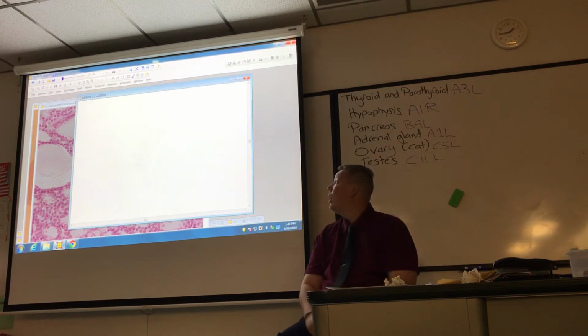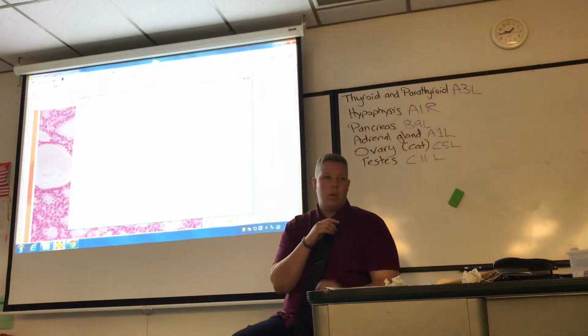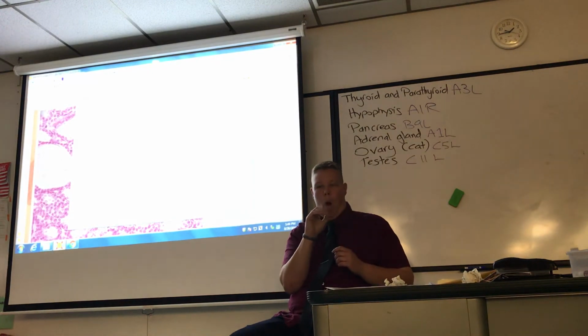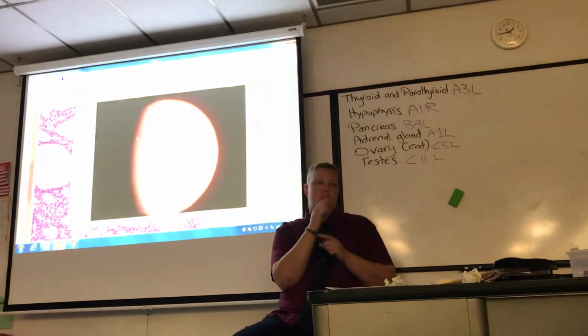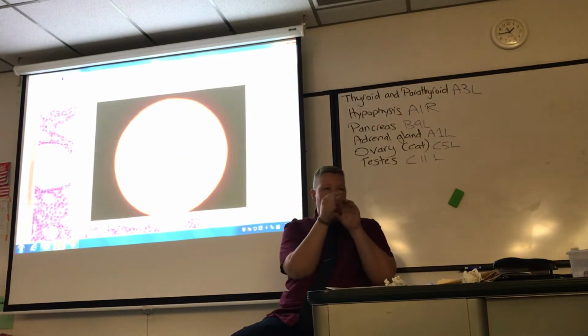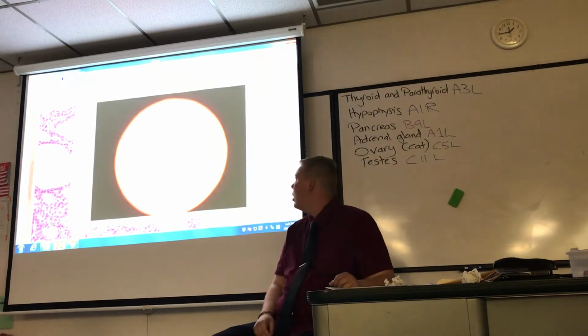So pituitary, we did that this morning. It was the first thing you did on your half sheet. Just look at this picture here. Let's go to 20x.